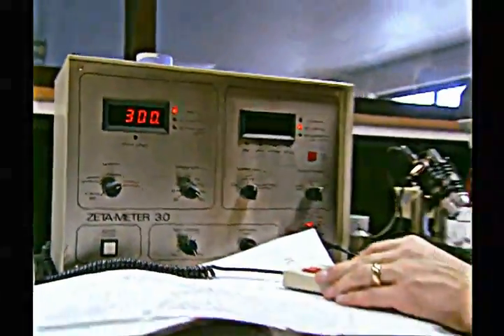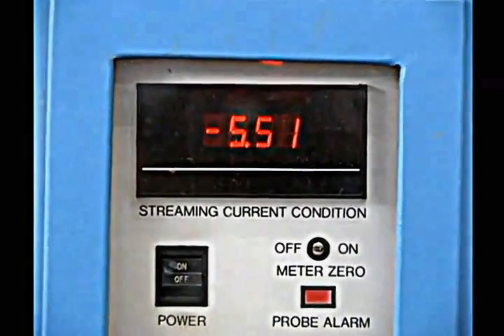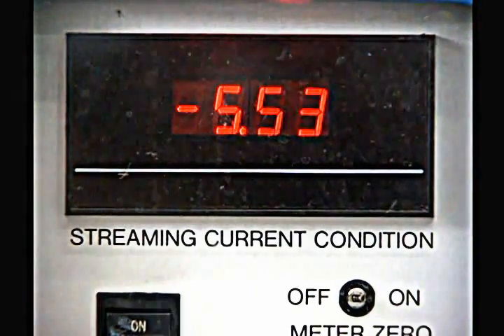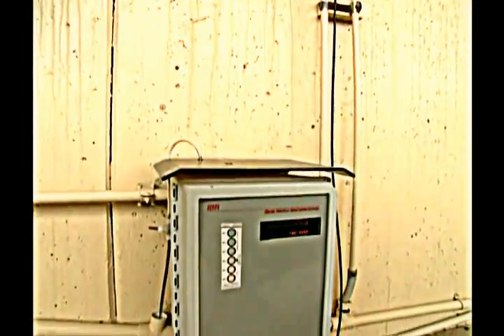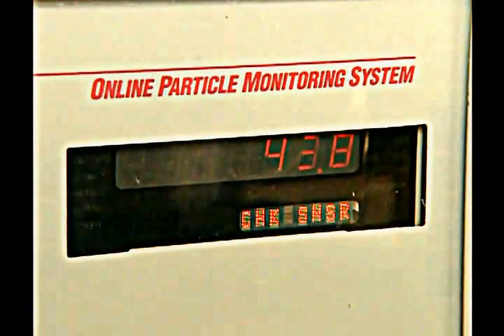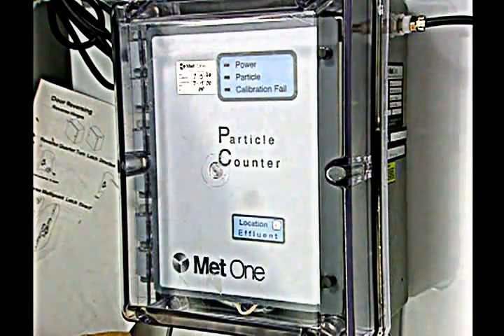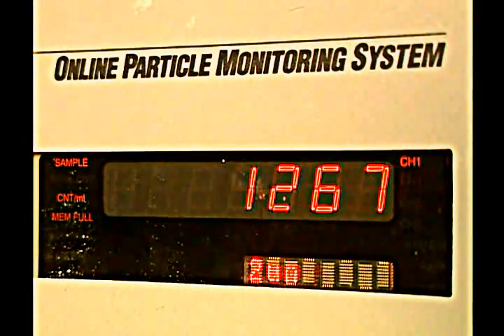An instrument called a zeta meter can test the zeta potential of the water. A streaming current monitor gives a continuous readout of the net ionic and colloidal surface charge in sample water. Particle counters operate by passing a fine stream of water through a laser or light source so a computer can determine the size and concentration of minute particles in the water. Particle counters give more information than turbidimeters regarding particle size and concentration, but are more expensive and more difficult to adjust and operate. Visual inspection is also important.